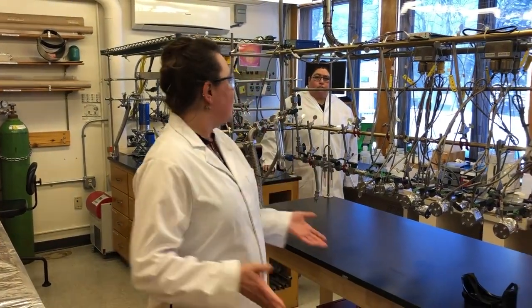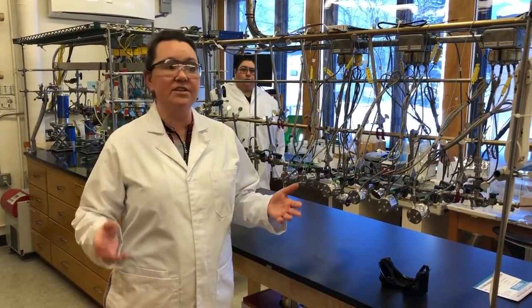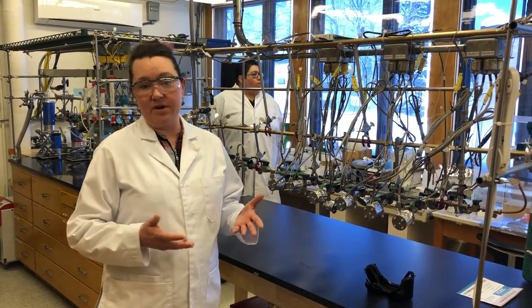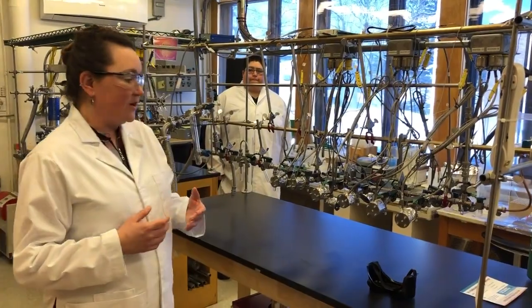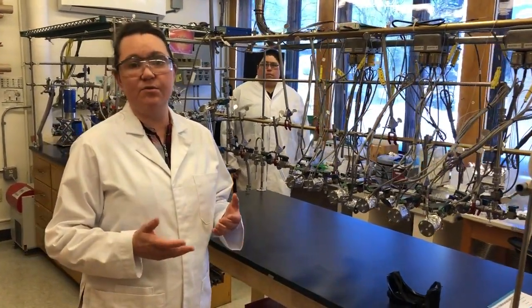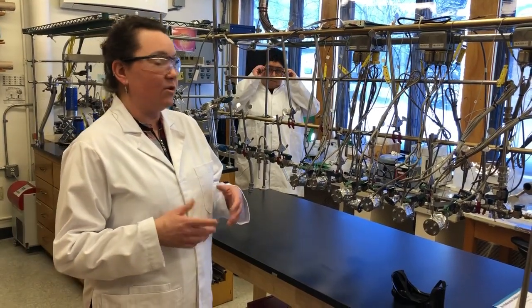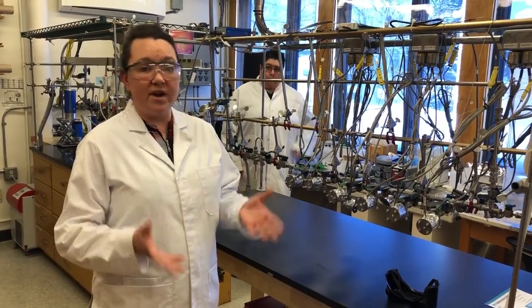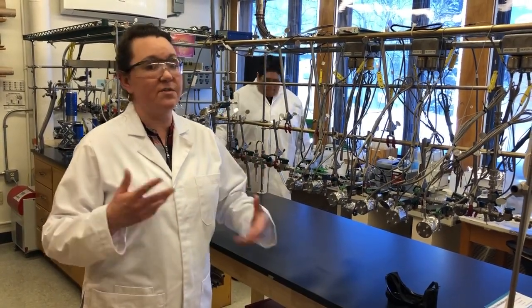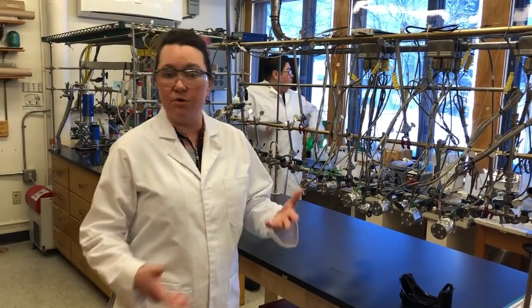So this is the Carbon, Water, and Soils Lab, and this is where we turn radiocarbon samples into solid carbon or graphite that then allows us to measure its radiocarbon content. So in an archaeological context, the radiocarbon abundance of a sample will basically tell you its age or how old it is. But in an Earth system science context, we can actually use radiocarbon abundance measurements to track the cycling of carbon through different portions of the biosphere, as in carbon turnover in soils, transport in oceans and streams, and things like that.